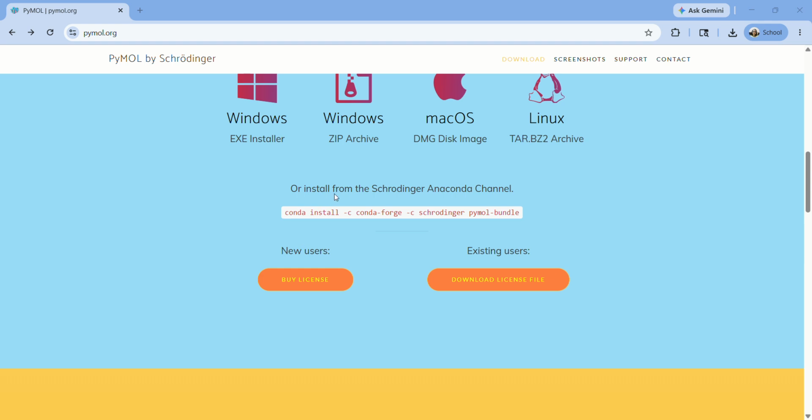Fine, it looks like this. Wow. If you teach protein to students, this software is very good for demonstration purposes. You can see on the left side it shows no license files, as it is for evaluation only. But if you are in a degree or masters program, it is very beneficial for you. And there are the different pockets.